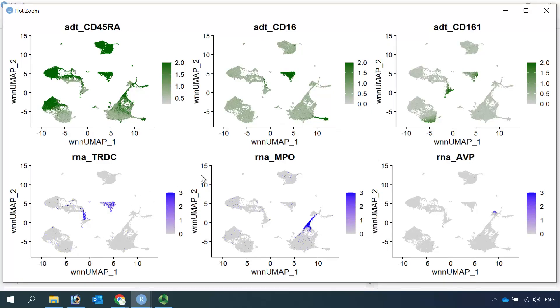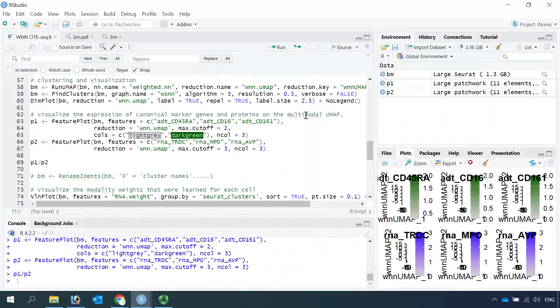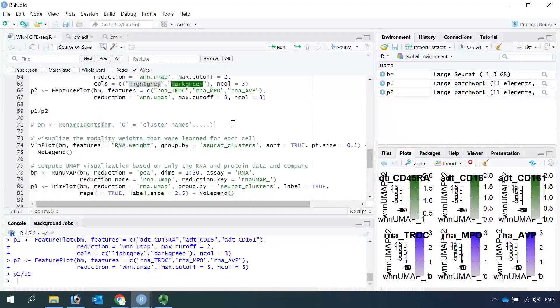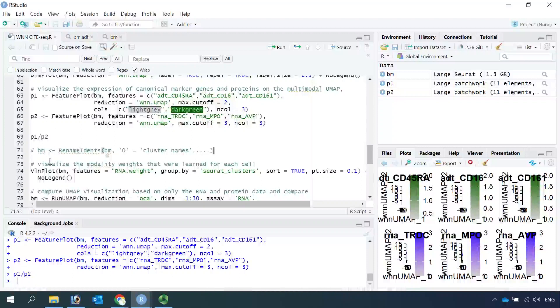This is just a demonstration — you can use different antibodies and marker genes to identify the cell clusters. Today I'm not going to label the clusters, but if you want to label your cells you can use the RenameIdents function to name your cell clusters after you identify all the cell types.